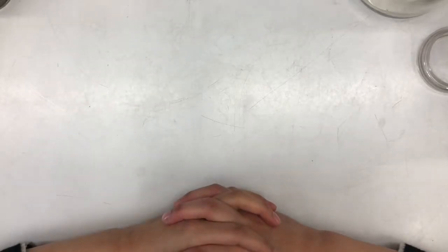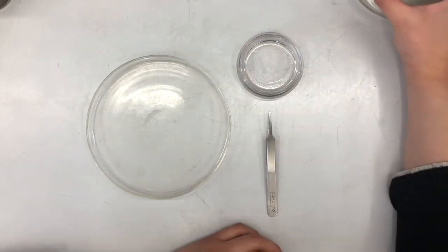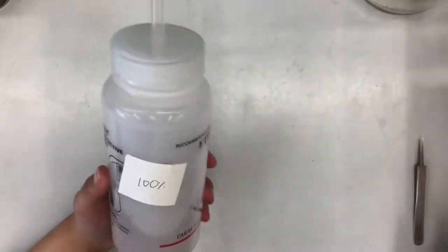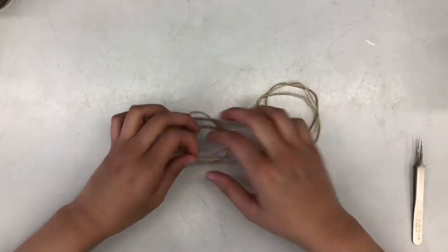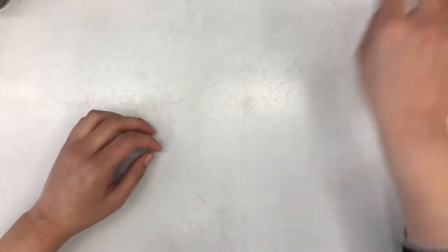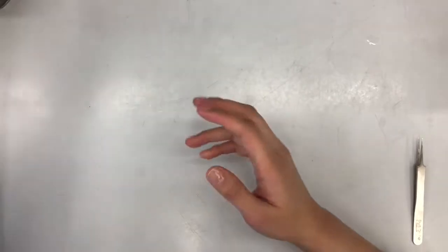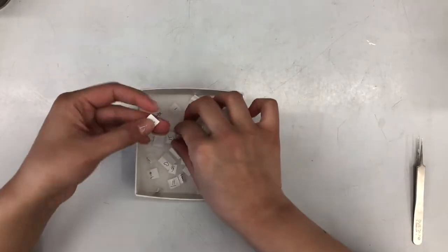Hi guys, so today I'm going to show you how to prep for a CPD, or Critical Point Dry. First you're going to need a large dish like this and a smaller one, and some forceps. You're also going to need a large bowl so you can discard your excess alcohol. You'll also need two wash bottles filled with 100% alcohol and 95% alcohol.